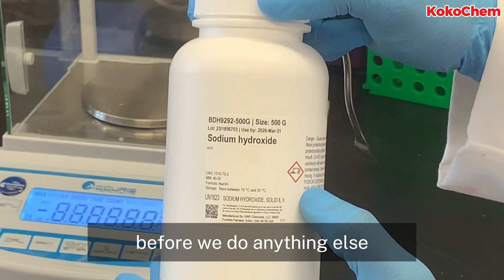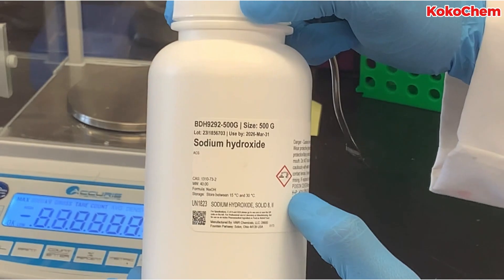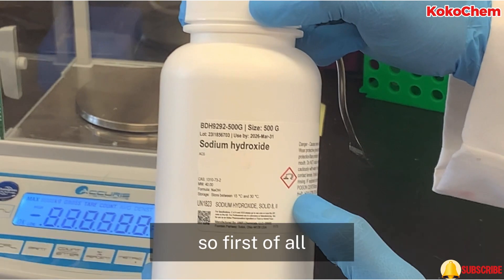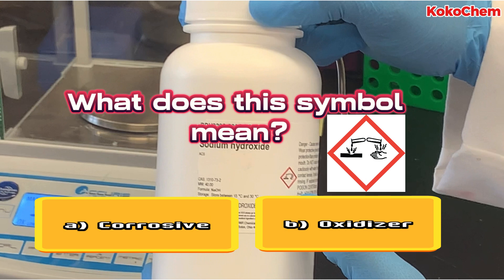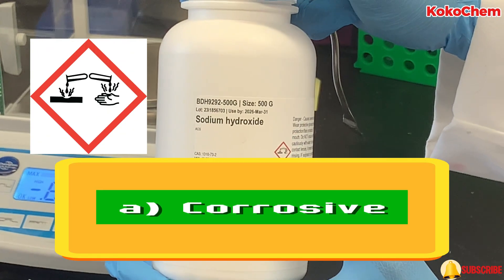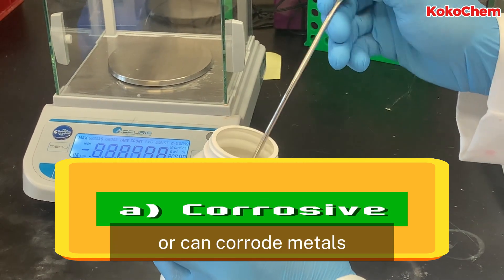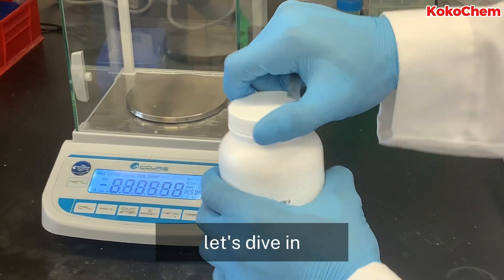Before we do anything else, we have to check for the safety labels on the sodium hydroxide bottle. We have to make sure we are being safe in the lab. So, what does this symbol mean? You are right — if you selected corrosive, it means sodium hydroxide can cause skin irritation or can corrode metals. Now that we have that out of the way, let's dive in.